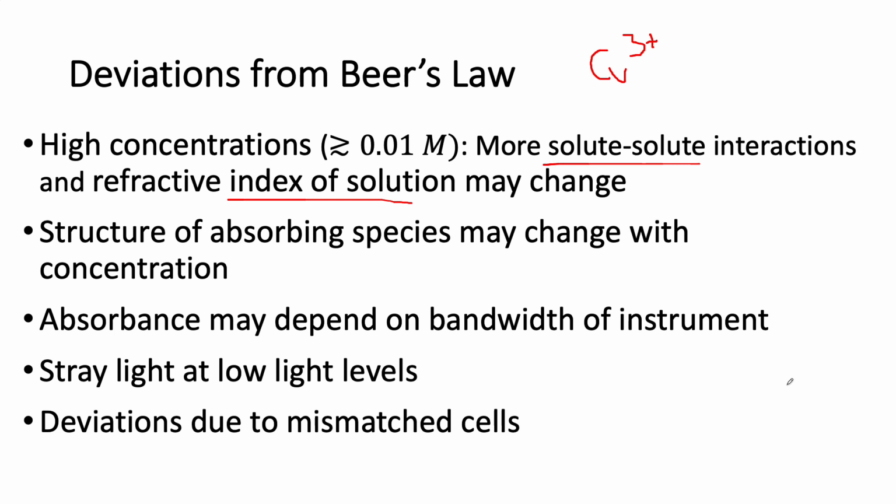One is that you might have noise, the zero point drifts, because it depends on electronics. There's electronics that warm up in there, and things can drift. Even sometimes it drifts because somebody's talking on the telephone nearby, or there's a rapid transit vehicle going by, and you can pick these things up. Vibrations in the building. And as things warm up, the amplifiers in there can change. Everything changes. So you don't want to measure things that are too high or too low, right?